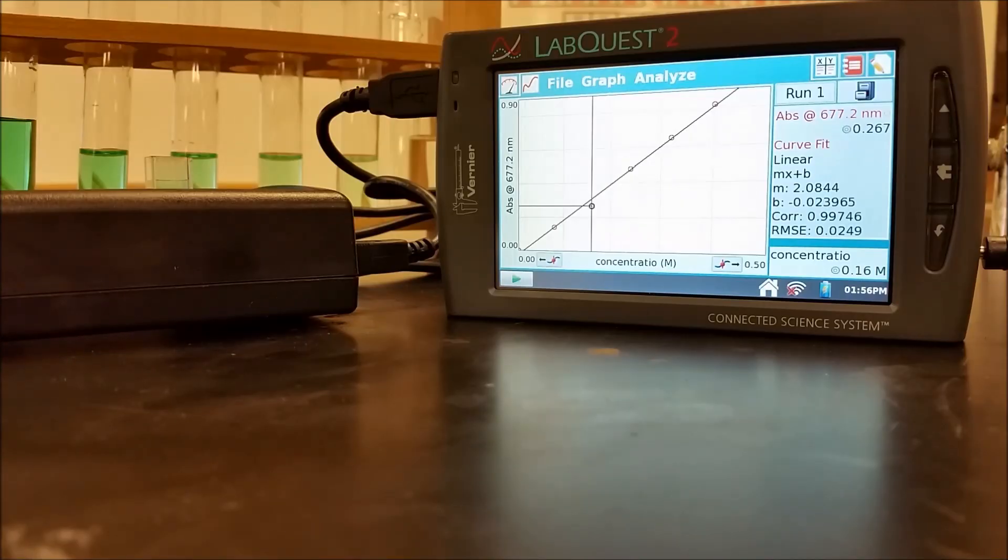So there it is. There's your data and there is how you would run this. And at this point you're done. You can go ahead and put your solutions back or dump them depending on what you're supposed to do with them.